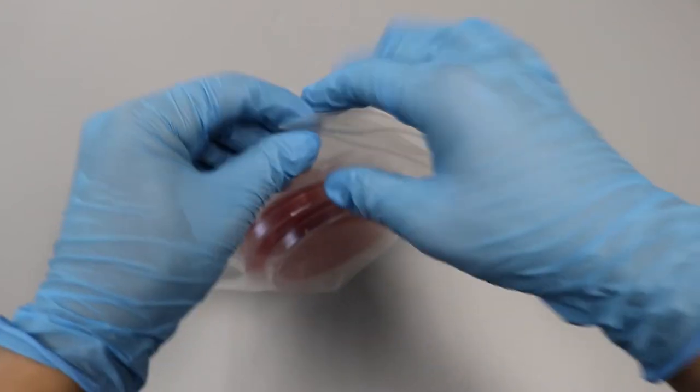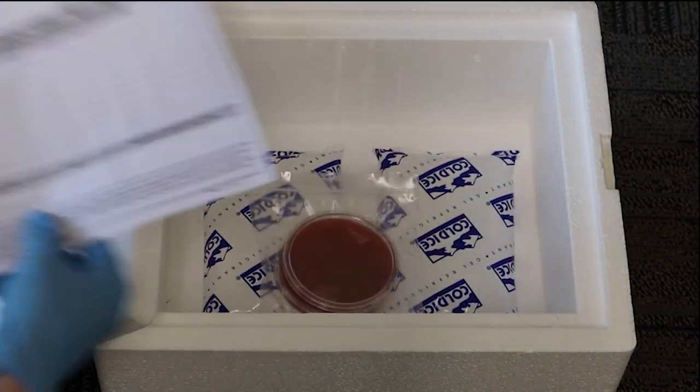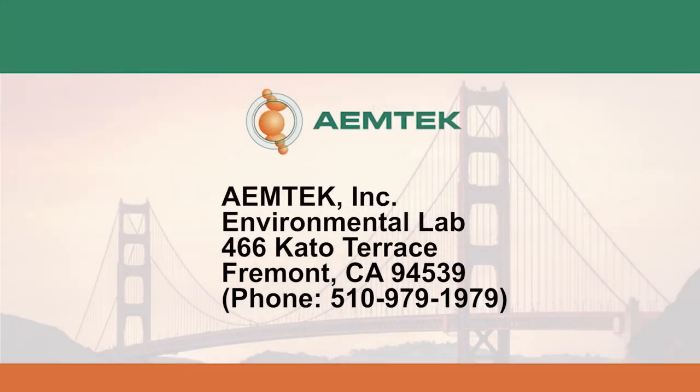Pack the plates into plastic Ziploc bags and place the bags as well as the COC form inside a cooler box with ice packs. Do not use dry ice. Ship the samples preferably on the same day of collection, but no later than 24 hours after sampling to the following address.